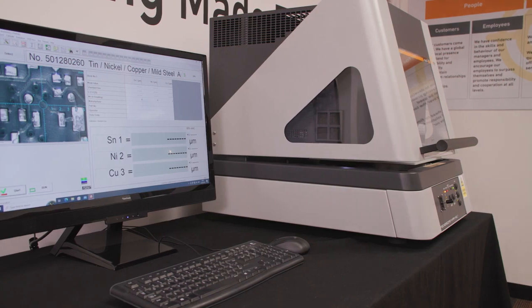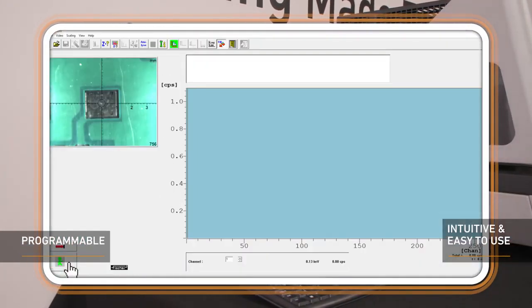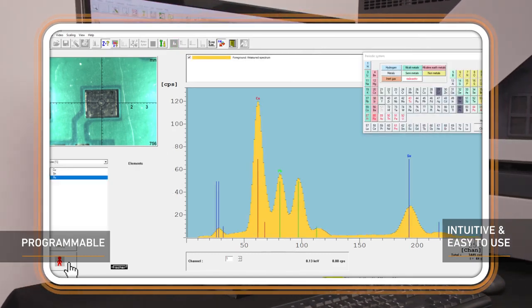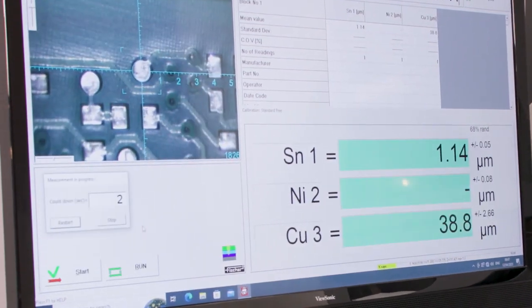The instruments have easy-to-use software, so FischerScope users can be up and running with their measurements quickly, regardless of experience. Clear measurement data is gathered and stored, enabling powerful reports laid out in a simple way.